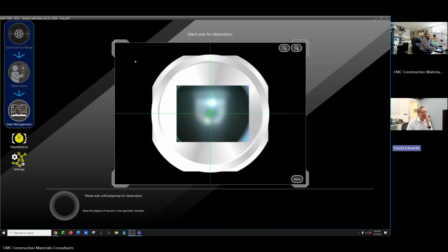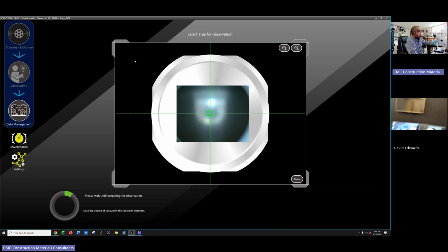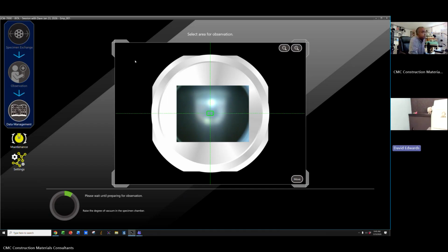It didn't retake the picture. Okay, reach up on the machine itself and push the vent button. So the middle button. I'm sorry, which button? The power button? Nope. Let's see.